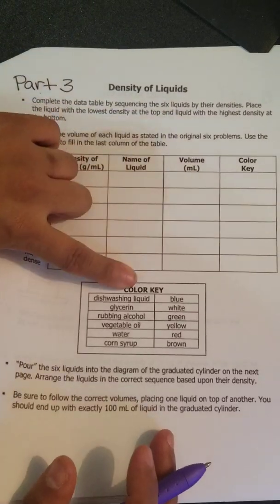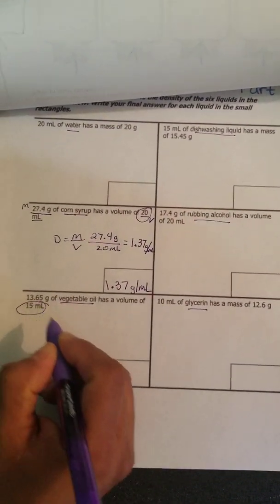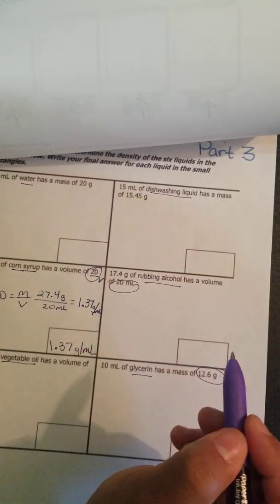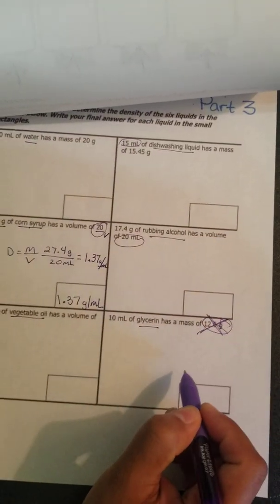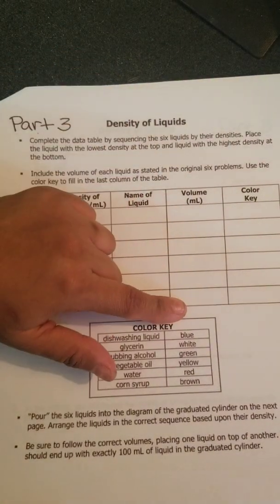The volume. Where are the volumes? Here are the volumes: 20, 15, 12.6, 20, 15. I'm so sorry. That's a mass. 10 mLs. And then 20 mLs. Those are the volumes for those liquids. You're going to fill them in here.